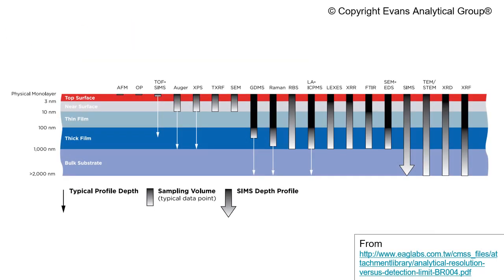Like other microscopy techniques, AFM allows us to get information only of the top surface of our sample, as is shown here. Differently from other microscopy techniques, AFM enables us to get a 3D image of our sample.